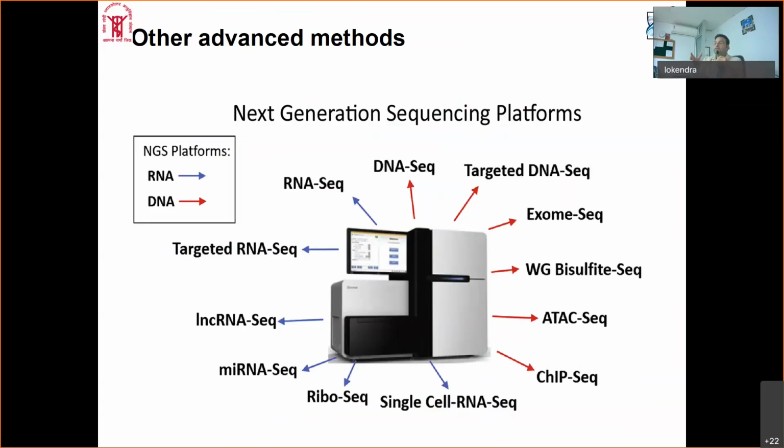So there is a big difference now and then, because that was the first time. Almost 3 billion nucleotides were sequenced, almost a similar amount in dollars was spent, and it took around 13 to 15 years to finally get the annotated sequence altogether. This is now very much reduced in terms of cost as well as timing, and also in reproducibility and effectiveness. This is happening only because of the advancement in sequencing technology.